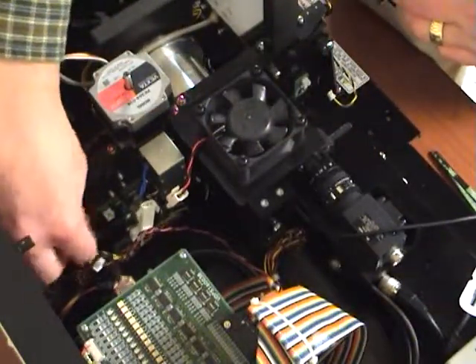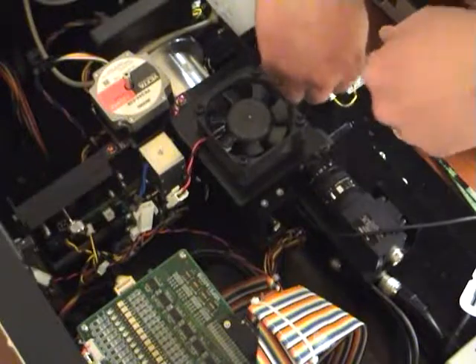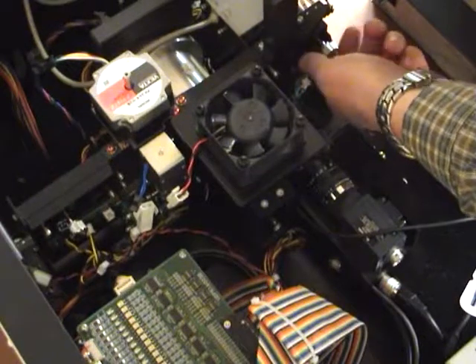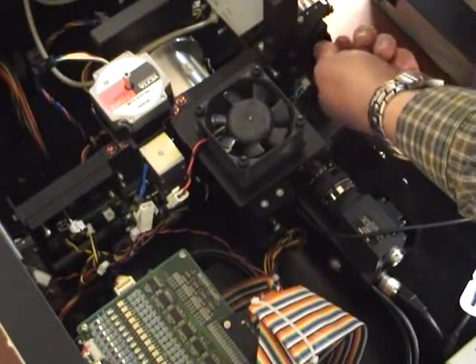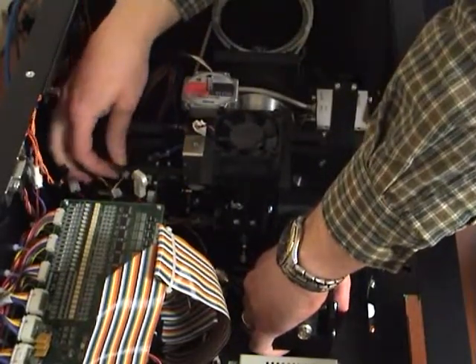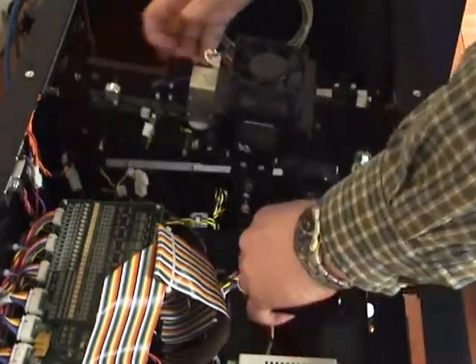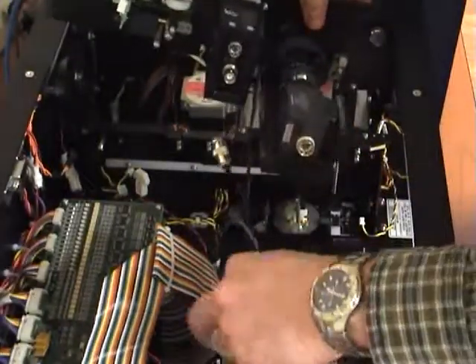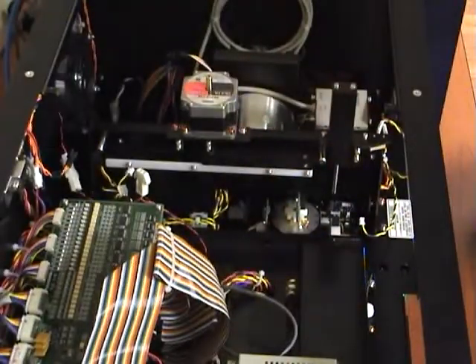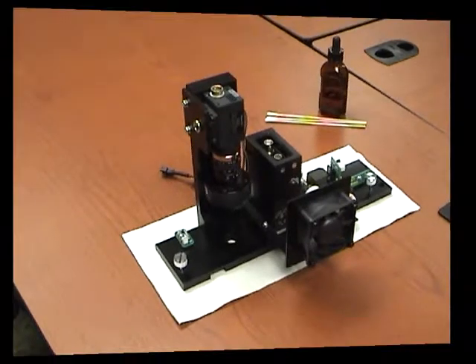Next, loosen the housing screws. These screws are designed to not be completely removed. Remove the housing by grasping the support bracket holding the barcode camera. Slightly jiggle and pull the housing back. Carefully remove the housing, being sure that all of the necessary connectors are disconnected and no wires are tangled. Place the housing face down on a soft cloth for protection.